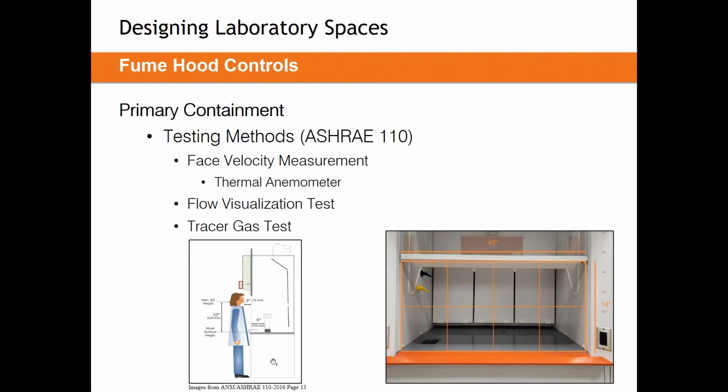We should also be doing flow visualization tests and tracer gas tests. Flow visualization tests are smoke tests. They can be done in 2 ways. The first is releasing a gas or smoke inside the fume hood when it's opened or closed.